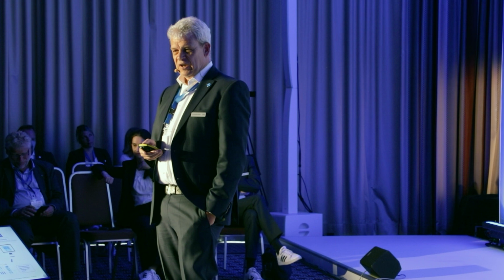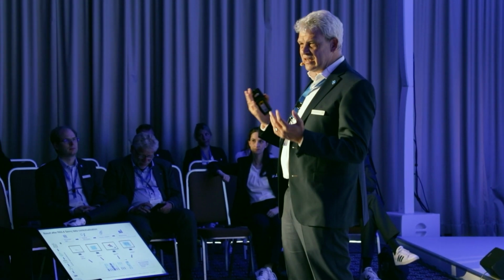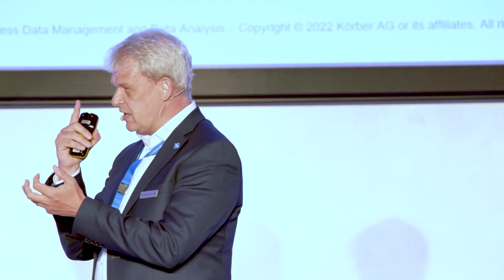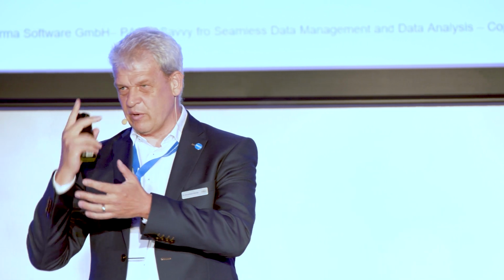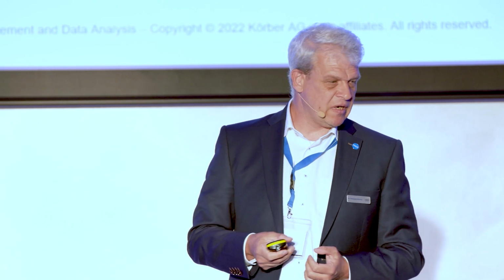Not at all. Therefore, of course, lots of tools are needed in order to do that. Of course, we have the data and all this, the classical multivariate data analysis tools, like you know them also from other tools, PCA, MLR, PLS, whatever. This is, of course, there. We don't have to reinvent the algorithms for that. They are there, right? Can be done directly in Savvy.